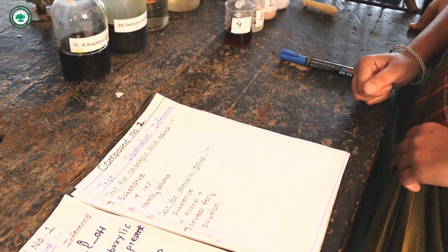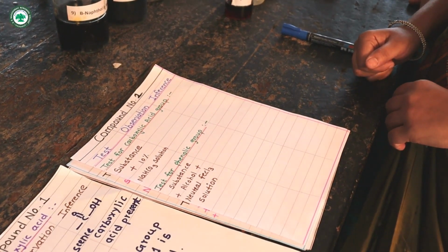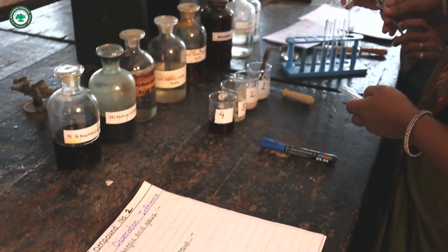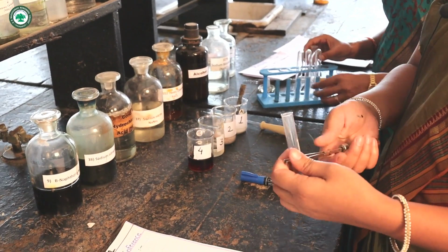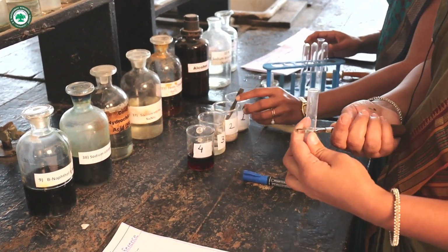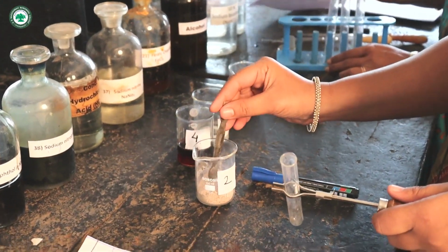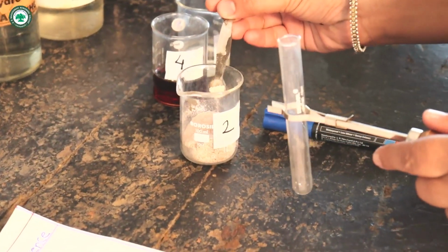Substance plus 10% sodium bicarbonate solution. Take the second compound in a small amount in a clean and dry test tube.